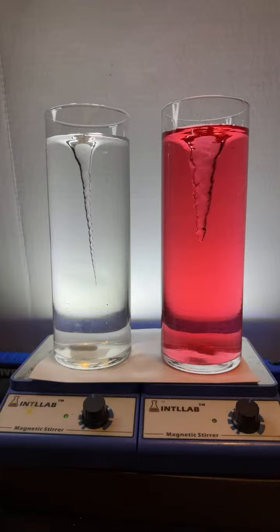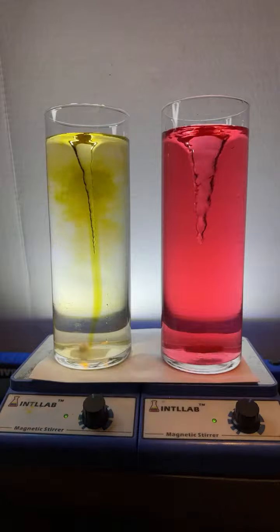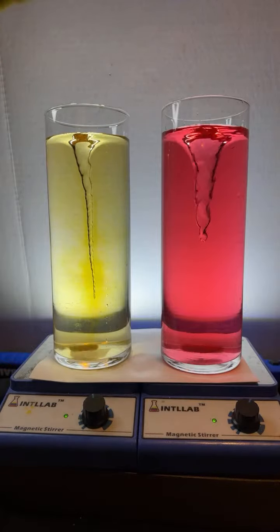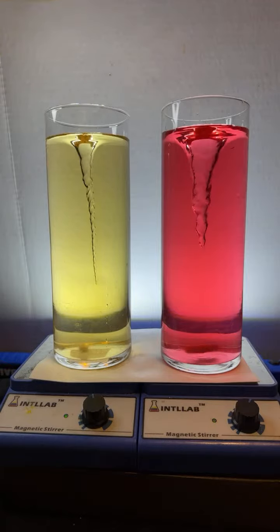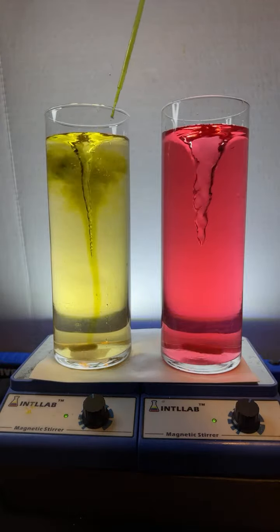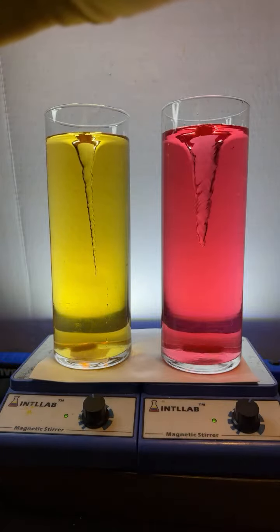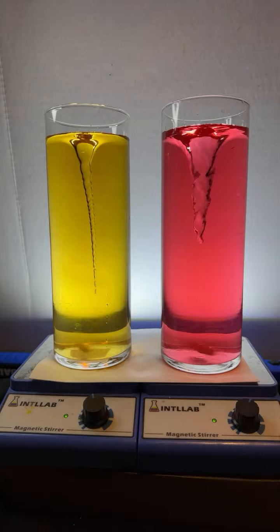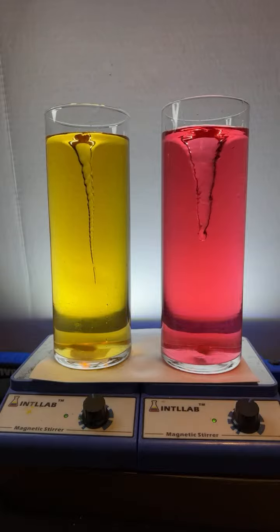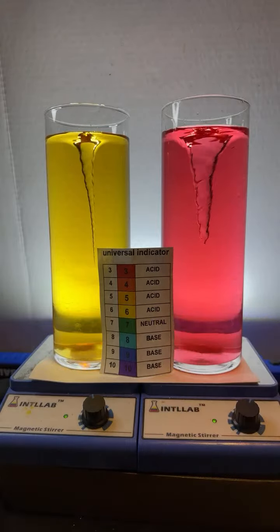Okay. All right, here we go. I'm going to add some universal indicator over here on the left. Universal indicator is a mixture of chemicals that changes color depending upon pH. And pH is just a description of how acidic or basic something is. So over here on the left, we see that the color is yellow. And that tells me, hey, let's get our pH scale up there with the colors. The yellow color tells me in this flask on the left, the pH is 6, which is just slightly acid.